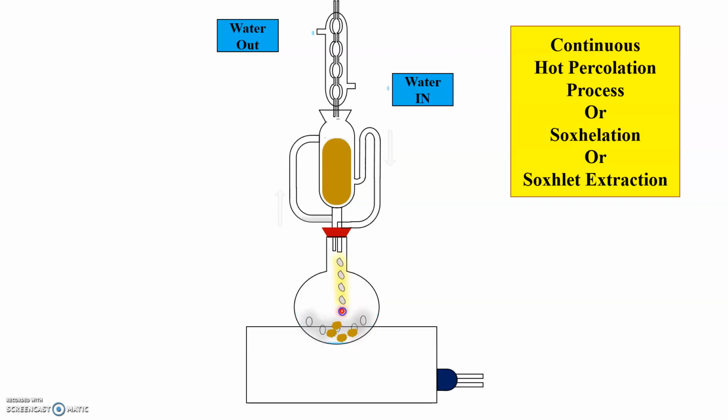This alteration of filling and emptying the body of extractor goes on continuously. The soluble active constituents of the drug remain in the flask, as we see here.